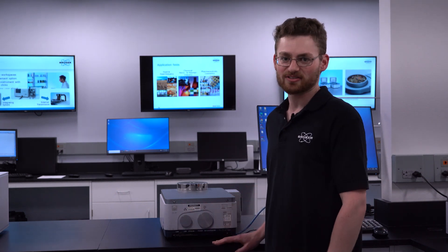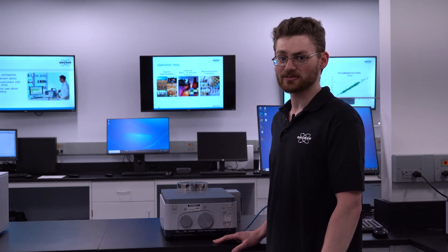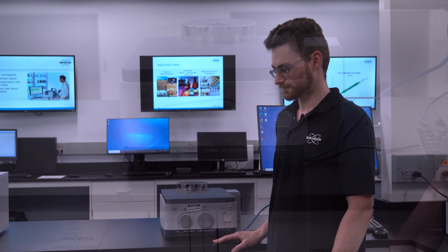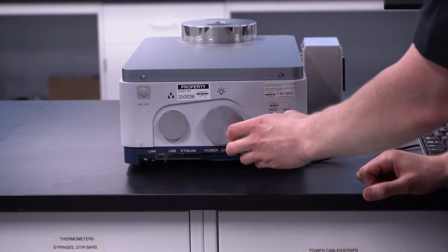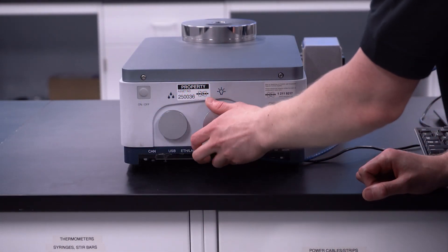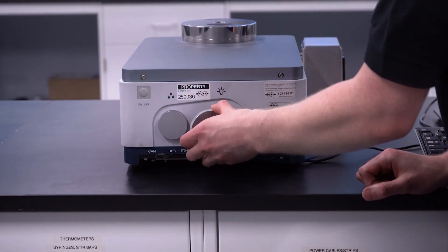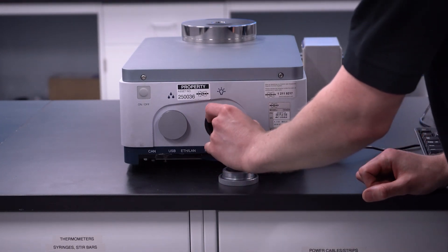The lifetime of the desiccant depends on the environment that the instrument is in. The Tango light source is easy to replace as unscrewing this cap and pulling out the light source.